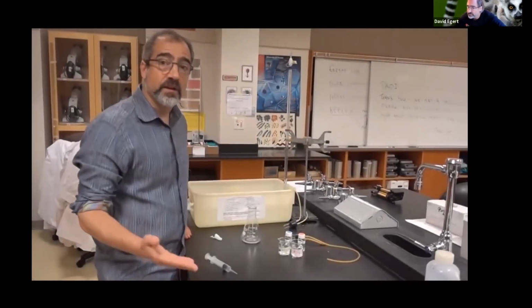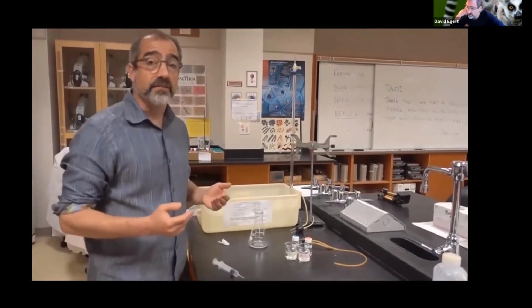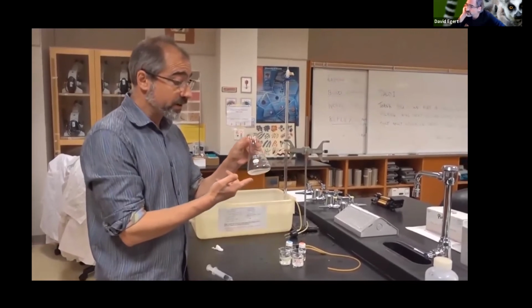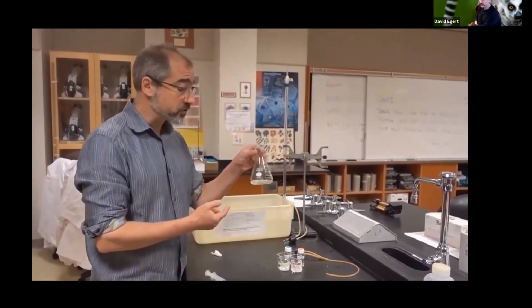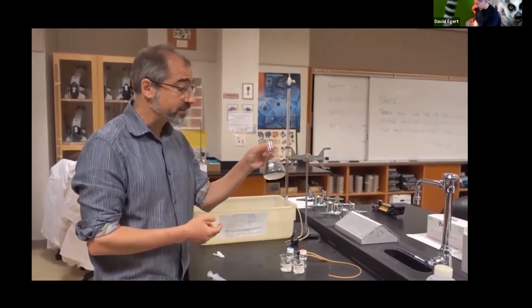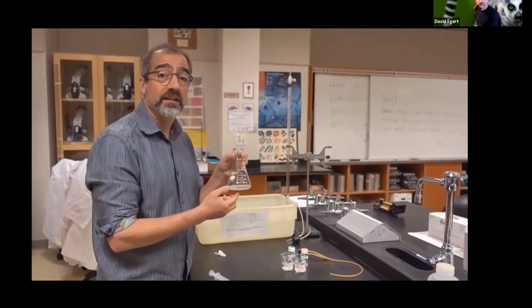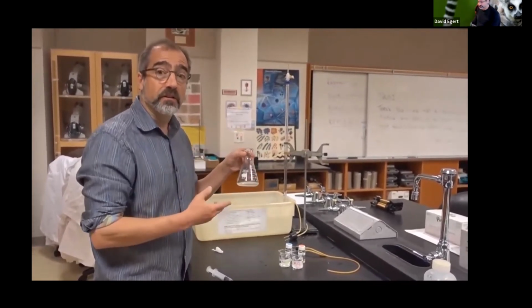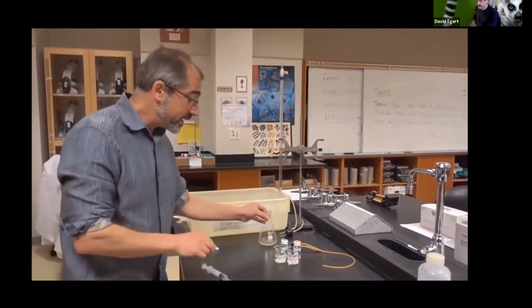All right, so I'm going to show how you set things up for the beginning of each trial. To start, my lab mate has already placed 10 mils of our diluted enzyme solution here in our little Erlenmeyer flask. Make sure before each trial you clean this off with a rinse of distilled water, so you have clean, fresh enzyme each time.